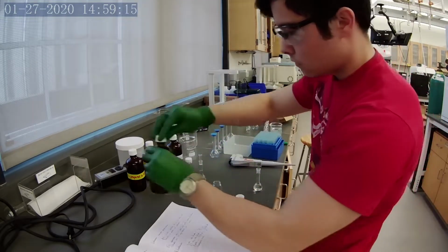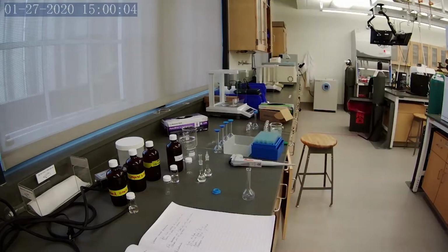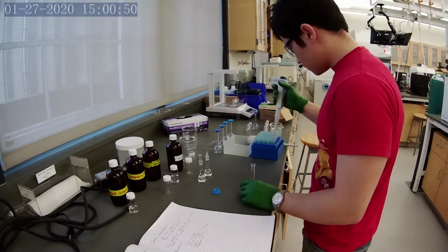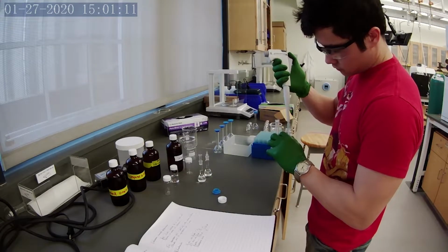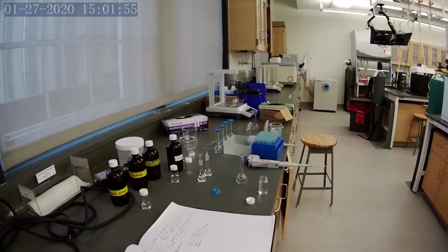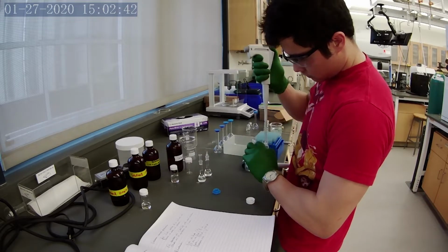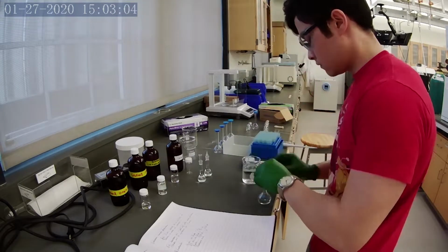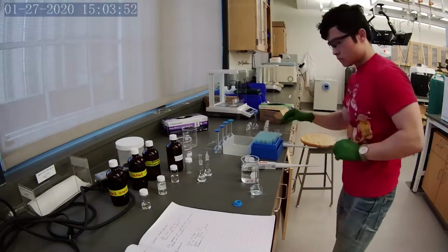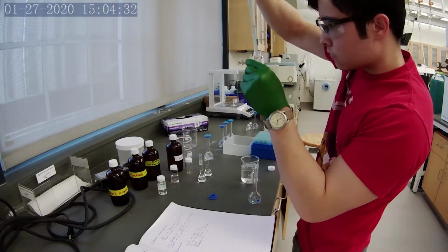There's reference solution 1, which is a tenfold dilution of the solution B, which is just propanol, and then reference solution 2, which is the propanol mixed with the solution A. So the reason why we have two reference solutions is basically to see where propanol comes out in the GC column and where ethanol comes out, so that we can associate those retention times with our analytes.